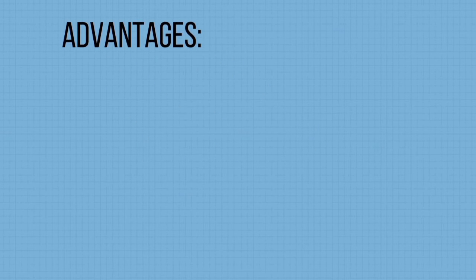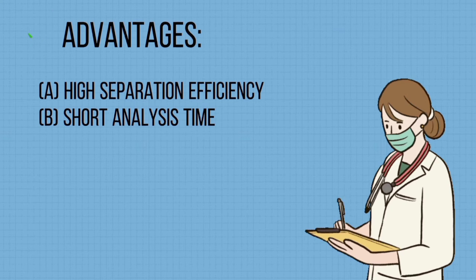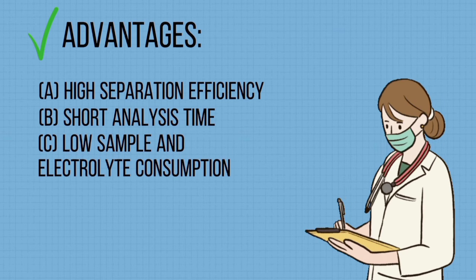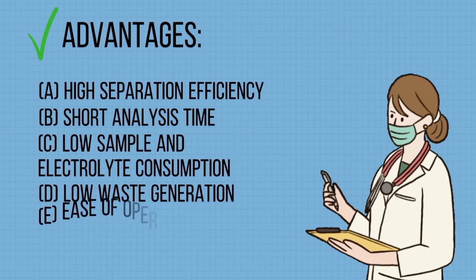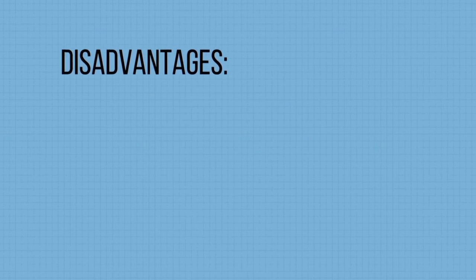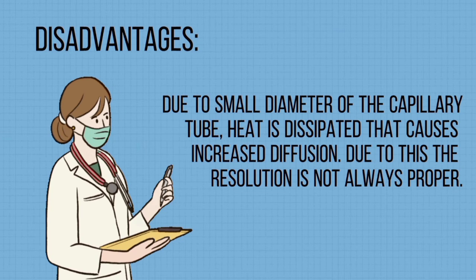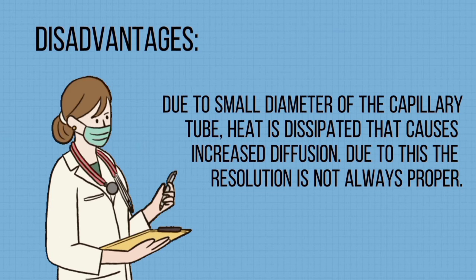Its advantages are high separation efficiency, short analysis time, low sample and electrolyte consumption, low waste generation, and ease of operation. While the disadvantages: due to the small diameter of the capillary tube, heat is dissipated that causes increased diffusion. Due to this, resolution is not always proper.